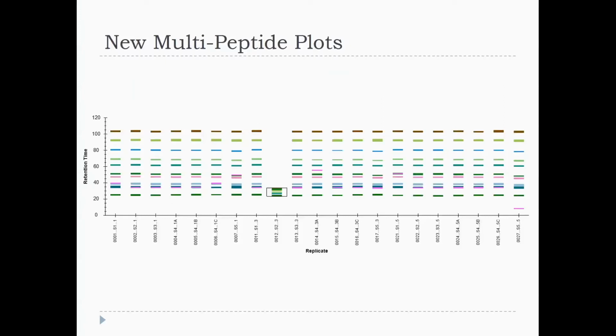This is from another site, same study, and I had run statistics. Again, I had just run Skyline command line, extracted the values, and started processing with R. And I was like, wow, look at all these great data, these great statistics I can get out of here. And then I finally went and looked in Skyline, and these are just the IRTs again. I went, whoa, what happened here? I did not notice this from the statistics, but I noticed it within a minute of having the document open in Skyline, and it turned out we had a corrupted file, which Ben was able to correct for us.